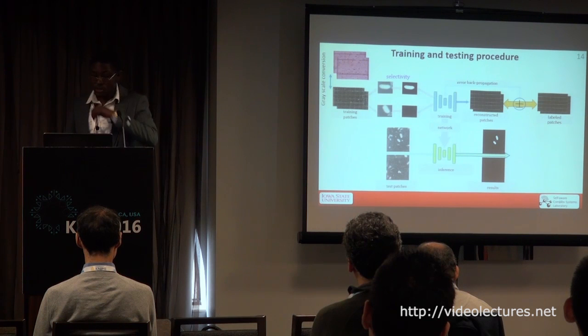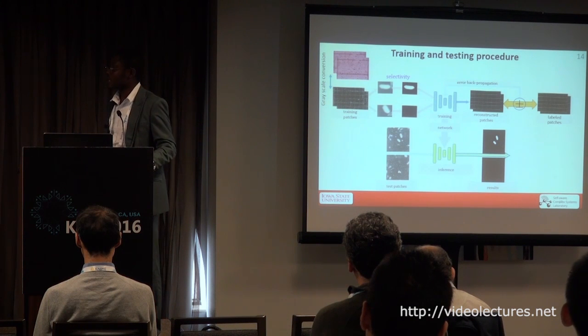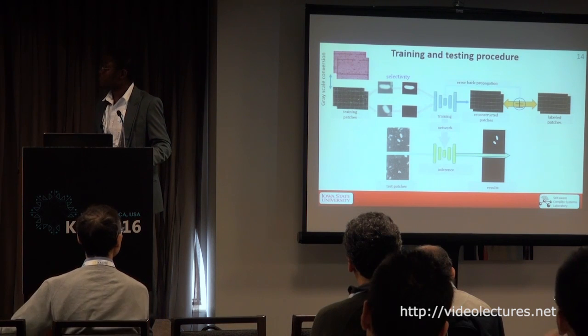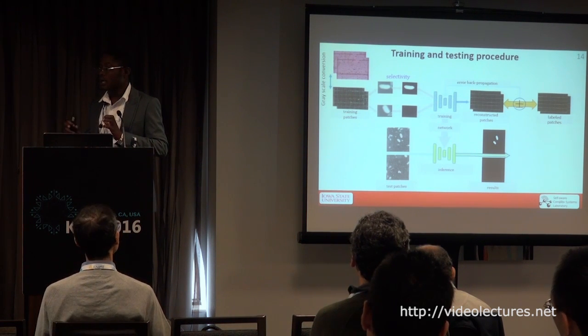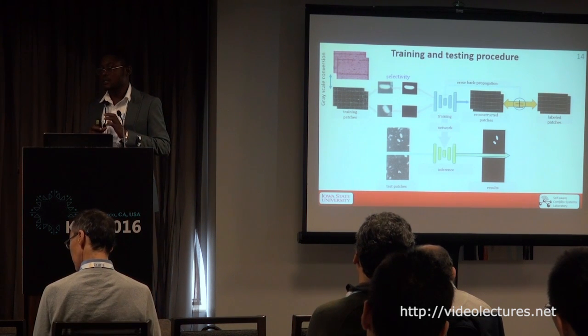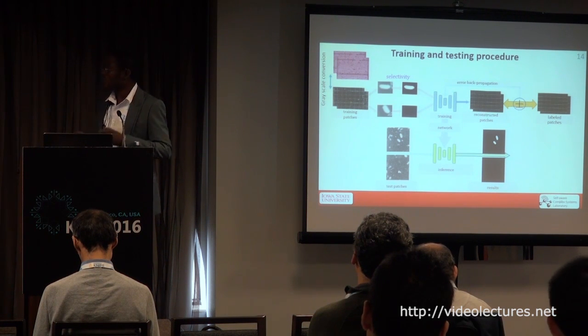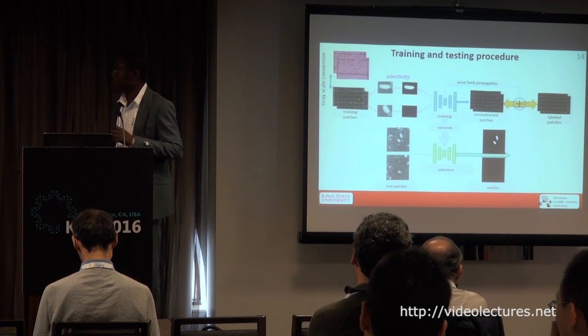So how do we do the training? We take the input images, and then we add what we call the selectivity criterion, which is basically, any post-centered egg is allowed, while other eggs which are not post-centered are not allowed, though they're still eggs. So that also includes the debris as well. And then we train the network using a backpropagation kind of algorithm, which is popular out there.